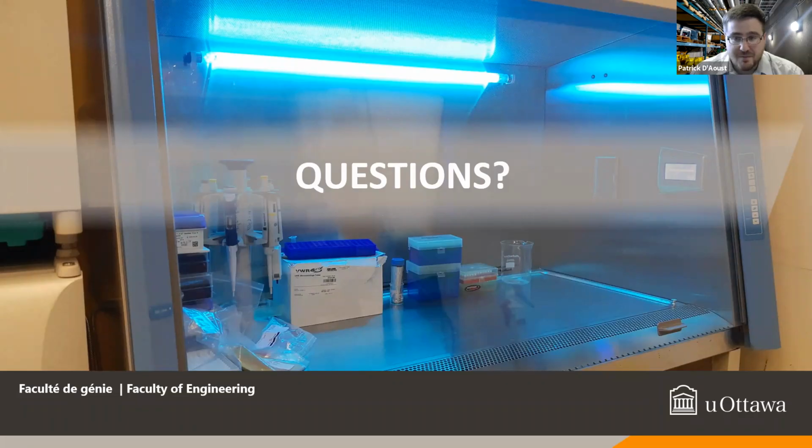We won't lie, we can see it, but doing meta-analysis, we've looked at a year's worth of data, looking at different parameters in the primary sludge and the influent. We did that one or two months ago, looking back at primary sludge and influent versus precipitation and snowmelt, and it's a very, very minute effect in primary sludge. We found a positive correlation between minute changes in different parameters in the primary sludge and precipitation, but it's less than 5 to 10%. So in this case, it's within the margin of error of qPCR and intraday variations.